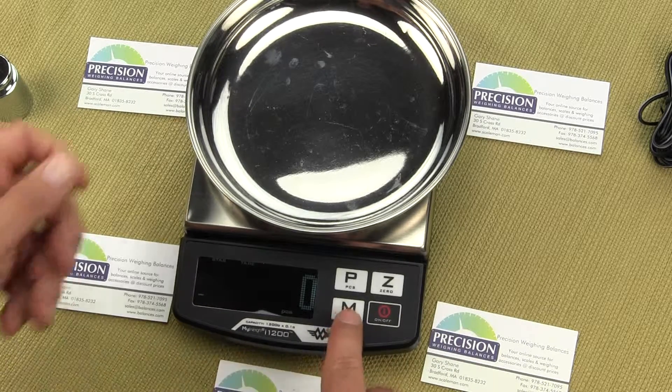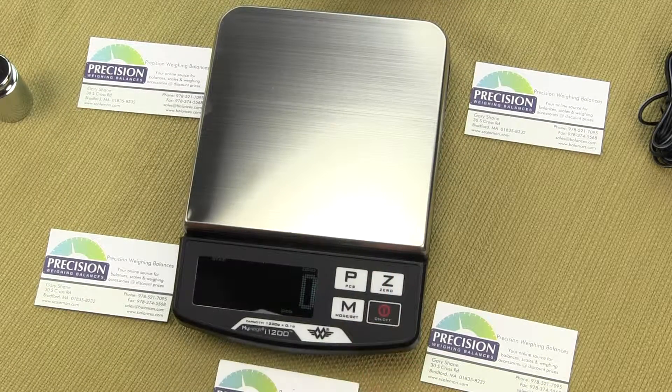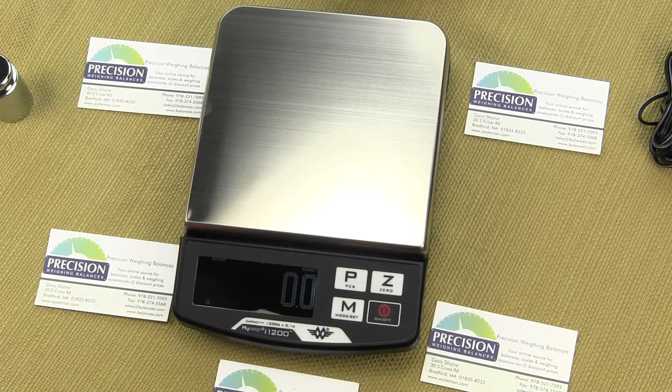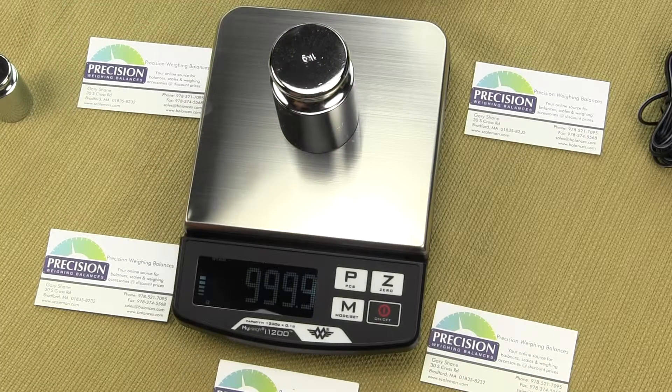To go back into weigh mode, remove the container, hit the Z key to zero it out, press the M key, and the next mode will be grams. If we put on 1000 grams, the scale displays the correct value. MyWay is a great value scale — you can visit our website at balances.com to order. We sell a lot of them to the educational marketplace.